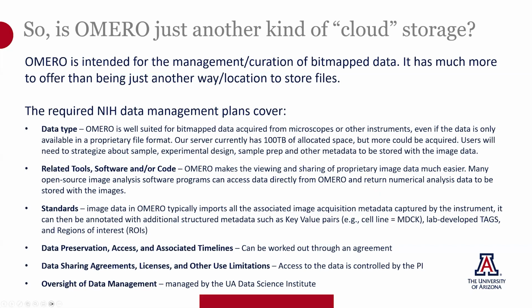We encourage our users to think about all the information that needs to be stored with that image data so that it is reusable. Because the joke is that the most likely user of this data is your lab. But 5 years from now, future you will try to get information from past you, and past you does not respond to emails. So it makes viewing and sharing data, as you'll see, much easier.